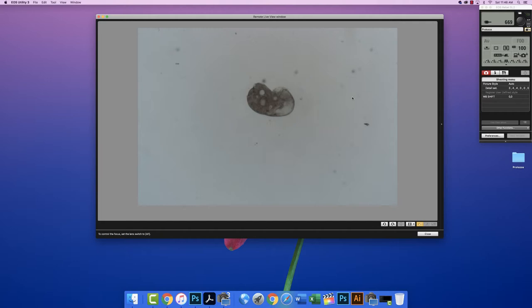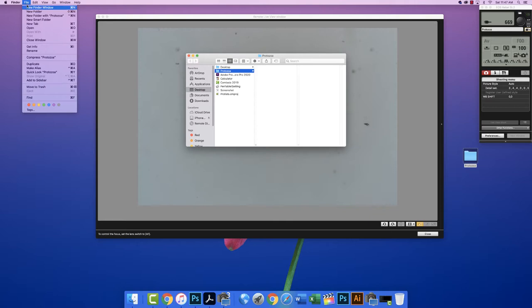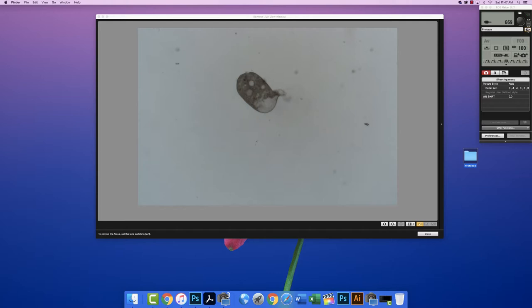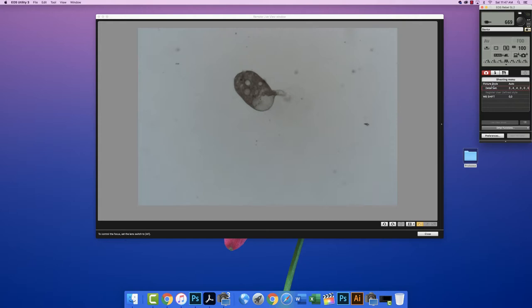I made a folder already called Protozoa, which is right here, but I'm gonna open up this Protozoa folder, and I'm going to make a new folder inside Protozoa called Stentor. I'm going to close this, and now I'm going to open up this folder. I'm going to go to Browse, and I'm going to click on Stentor. And I'm going to open Stentor and press OK. So now we're saving these images to Stentor, and I'll just have to try to remember to make a new folder for each sample that we look at.